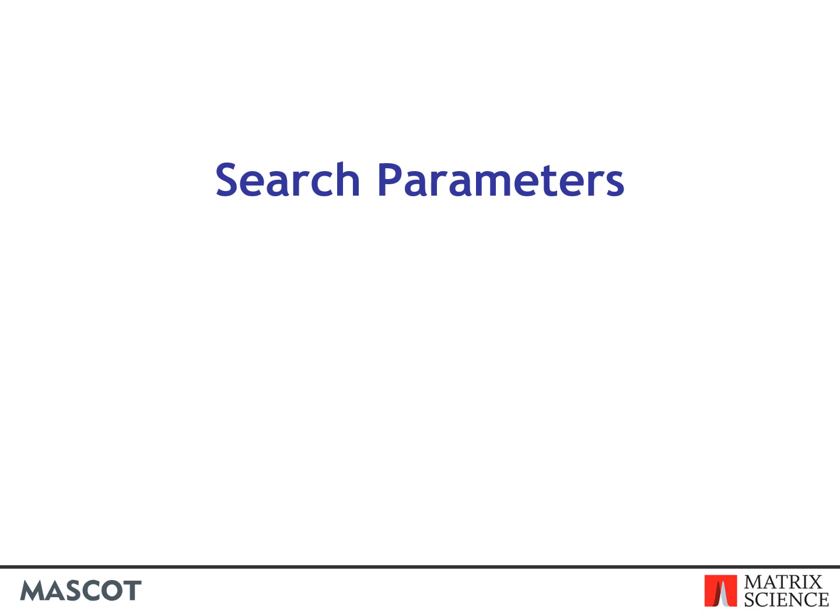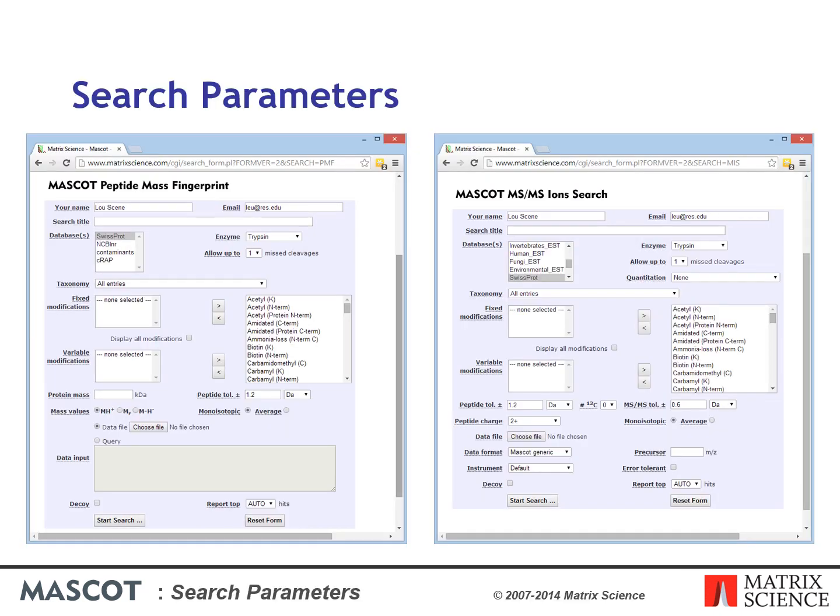In this presentation, I'll be describing each of the Mascot search parameters and providing practical tips on how to choose the most appropriate settings for your data. In this presentation, we will describe each of the Mascot search parameters.